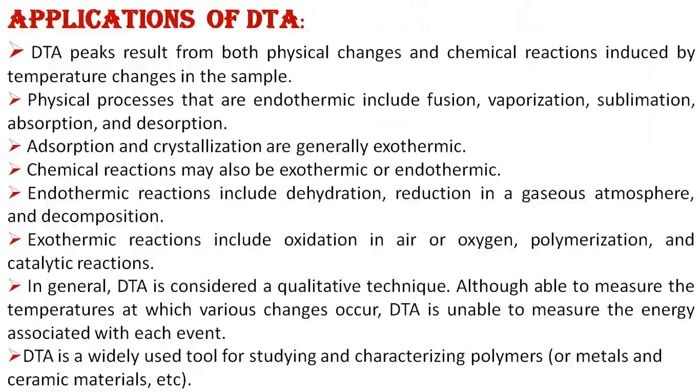Now, next is the application of DTA. DTA picks up the results from both physical changes and chemical reactions induced by temperature changes in the sample. Physical processes that are endothermic include fusion, vaporization, sublimation, absorption and desorption. Adsorption and crystallization are generally exothermic. Chemical reactions may also be exothermic or endothermic. Endothermic reactions include dehydration, reduction in gas atmosphere, and decomposition. Exothermic reactions include oxidation in air, polymerization, and catalysis.